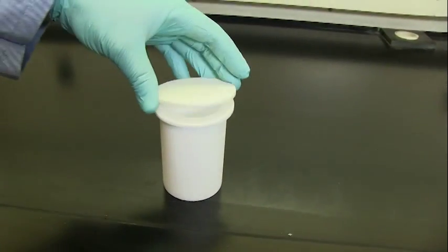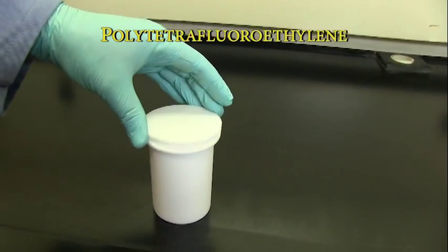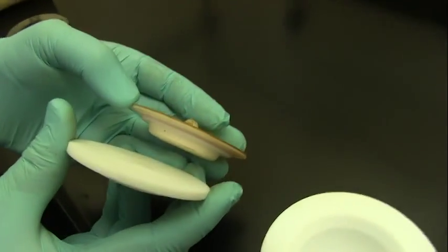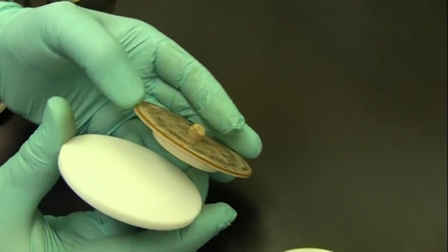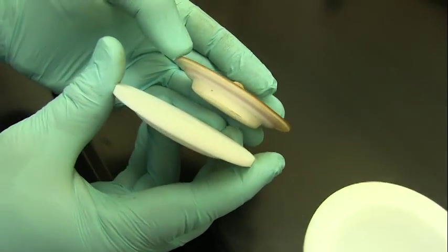The cup and lid of this internal high pressure vessel is made of polytetrafluoroethylene or PTFE. PTFE has a tendency to creep or flow under pressure or load. This tendency is present even at room temperature and it is accentuated at higher temperatures.